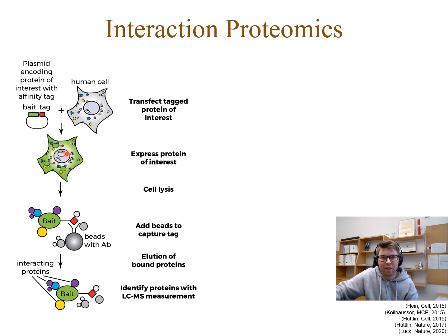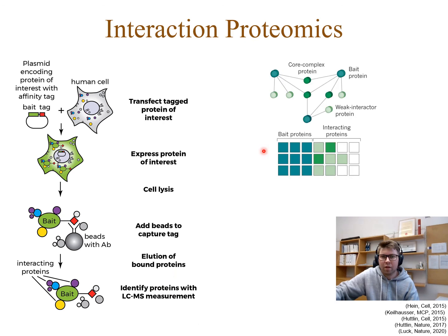After cell lysis, your bait protein can be fished out using antibodies towards this affinity tag, and proteins that co-purify with the bait can be quantified using mass spectrometry.